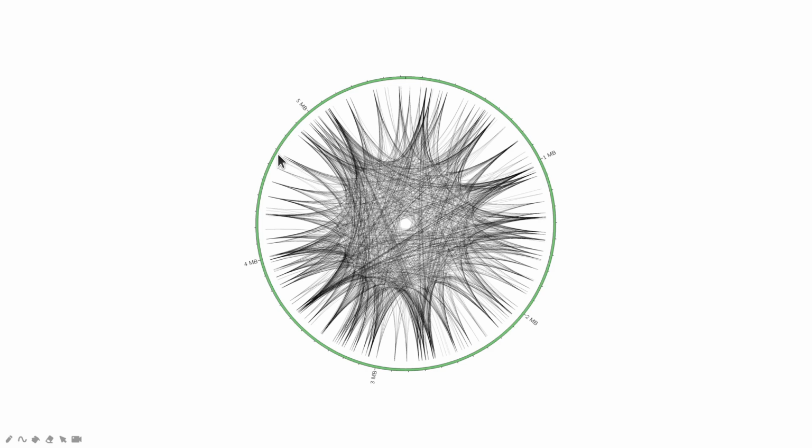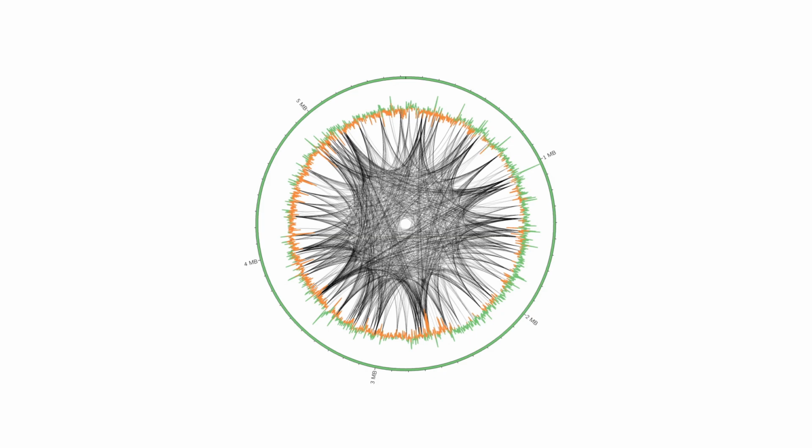So if, let's say, we have a link from this region to this region, that means that those regions are repeat sequences. That's basically what this means. All right, so that's what we are going to do now. With this plot, we add something else, and that's the GC Skew. So at the end of the day, we are going to generate this final image here.